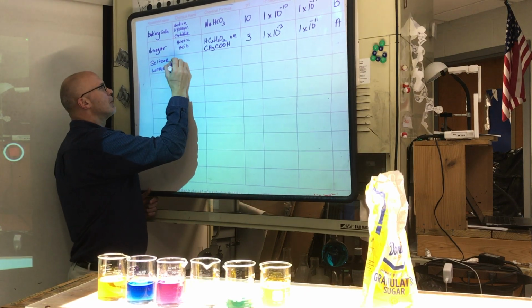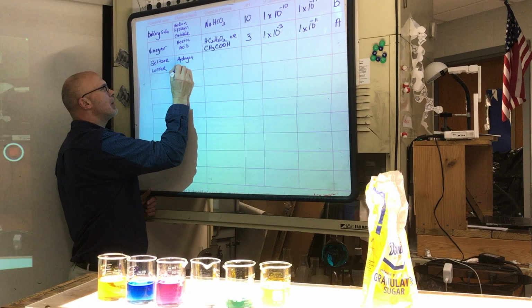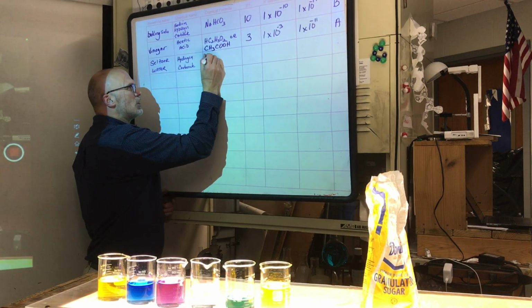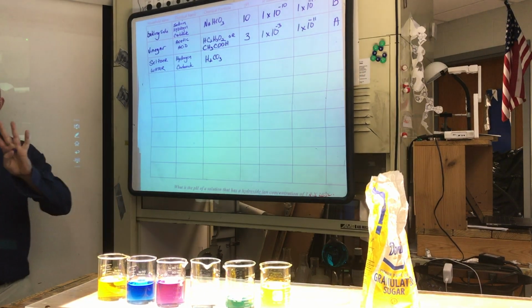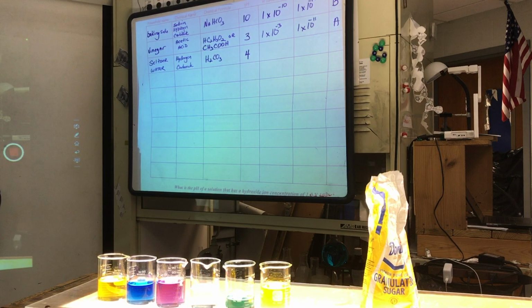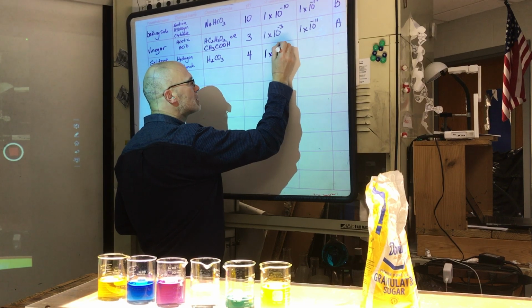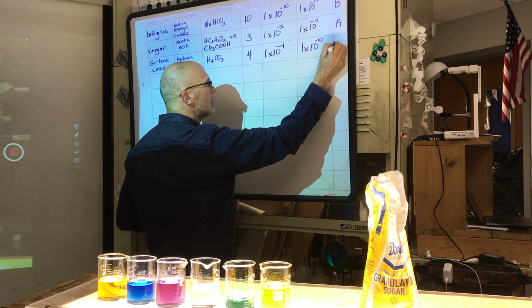So seltzer water, we're gonna go to hydrogen carbonate. You could use carbonic acid as well, doesn't matter. Chemical formula, H2CO3, notice the H is in front. This pH was actually a 4, slightly higher, because of that green color that we got in bromocresol green. It was in between. H plus ion concentration, 1 times 10 to the what? Negative 4. What's the base? 4 plus what is 14? 10. And this is, of course, an acid, below 7.